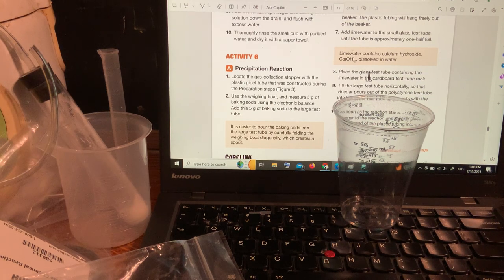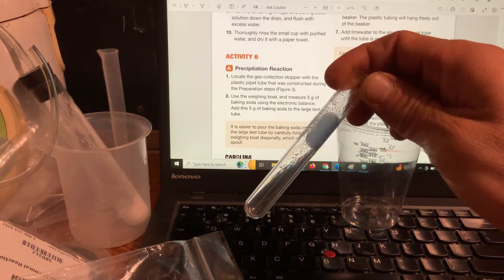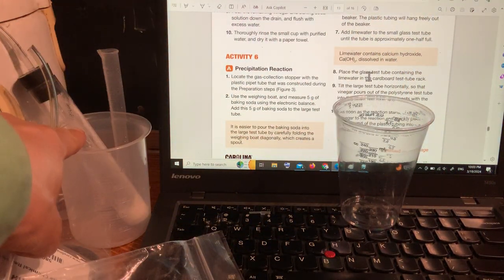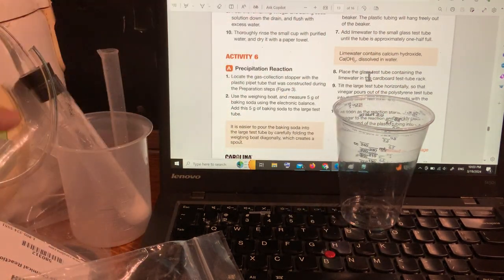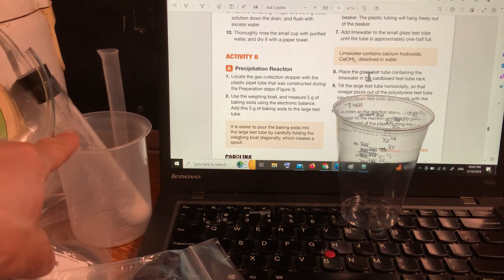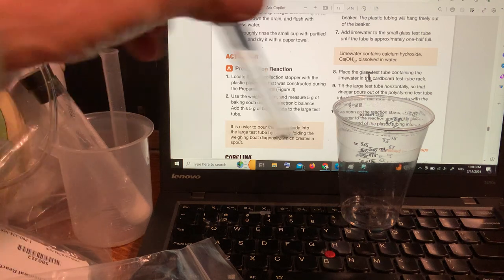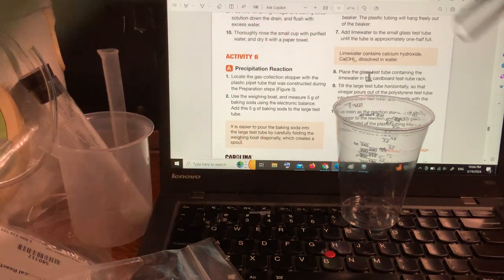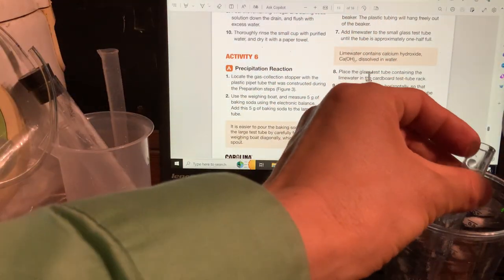Okay. Now the small glass test tube, I'm going to use that again. It was from the previous experiment, the one with the candle, right? But I have to clean this. It doesn't have to be dry. It just has to be clean. It's best if you use purified water to clean it. The large test tube you do not need to clean with purified water, but this one, it's best to use purified water. Why? Because in the large one we're mixing baking soda and vinegar, and those don't care if the water is pure or not. But in this one, we're going to put lime water, and that might care. Okay? So let me use this cup to rinse this.